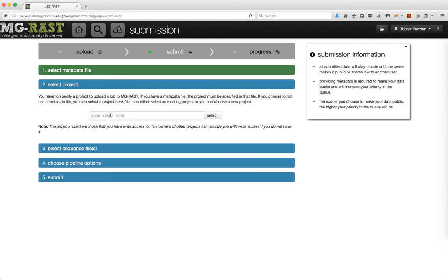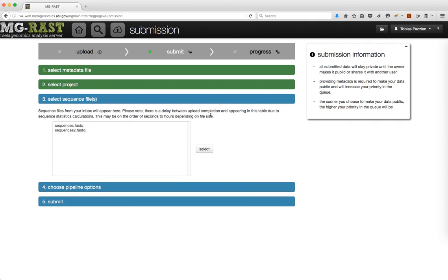Select the name for your project and click Select. Select the sequence file you want to process and click Select.